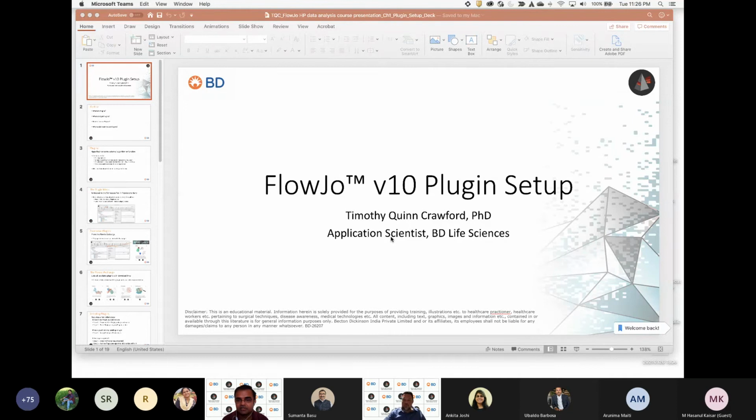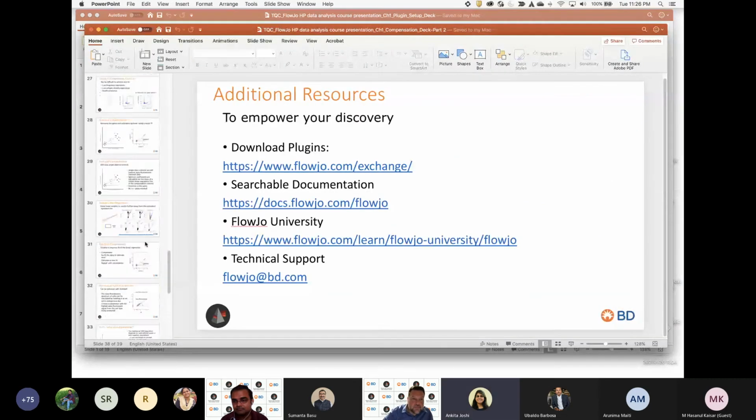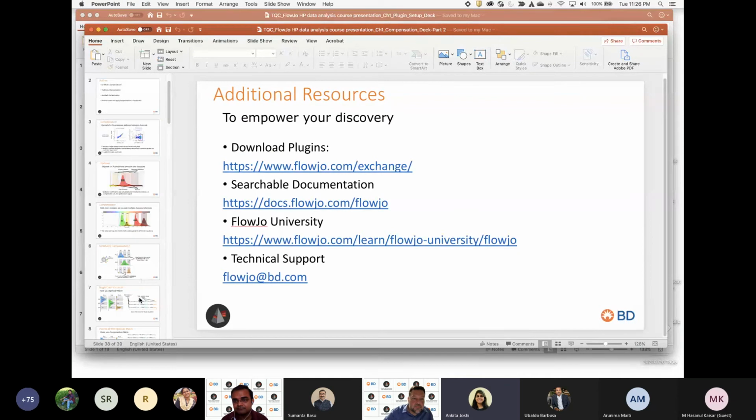Okay, we can have the answers now. Participants, please select the answer which you feel is correct. We are seeing responses towards D and now one towards A.